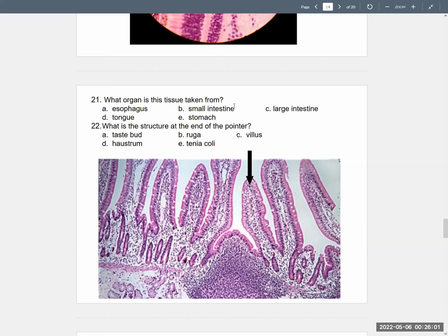So you have to get used to being a little flexible, you know, when you see different colors or whatever, but everything's here. Now, I said there are goblet cells, even in the small intestine. And those are these small white ones that you see here and elsewhere.